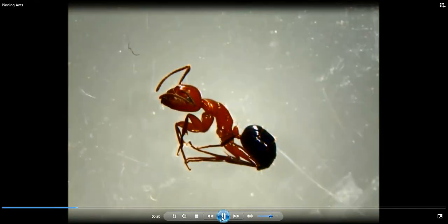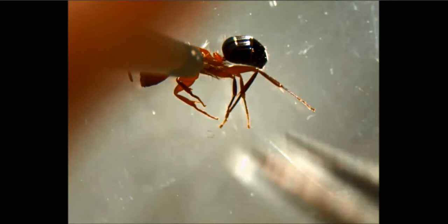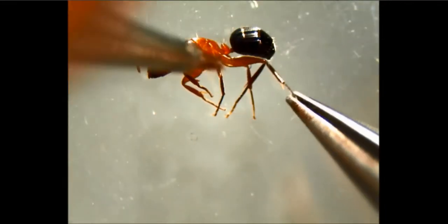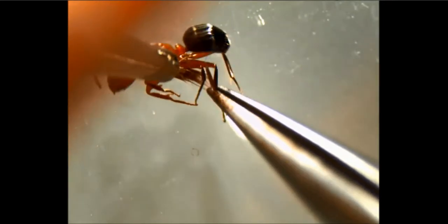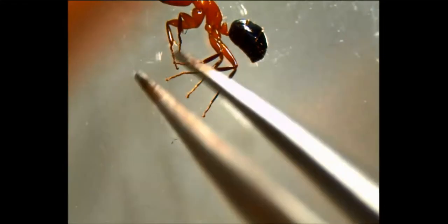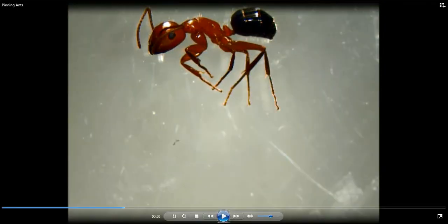Another thing you can do is use a soft paintbrush like this one. You can hold the ant down, and that helps a little bit to move the legs into place. You can also use fine forceps while holding the ant down to move the legs. But be aware that with certain ants, especially softer ants, you'll pull the legs right off. This is okay for really big, tough ants like this carpenter ant, but it wouldn't be so good for small ants like cheese ants.